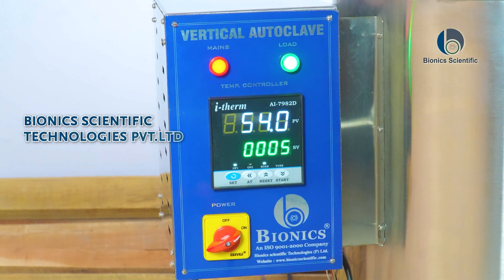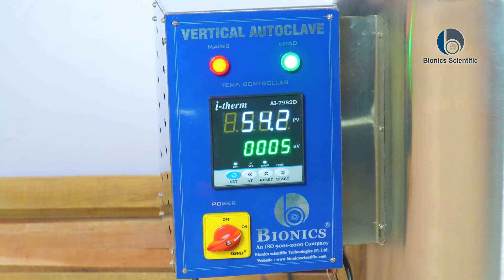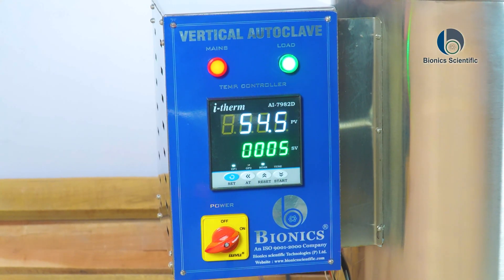Welcome to Bionics Scientific Technology, a unit of Cartel Projects Pvt Ltd. Today we are introducing our new product, the Vertical Autoclave.